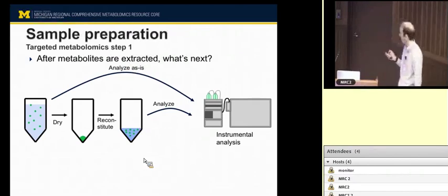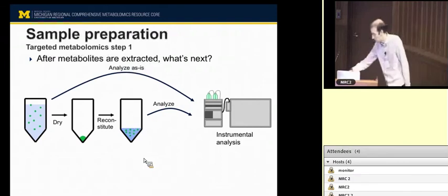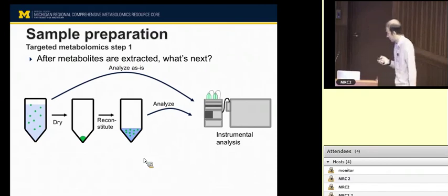And then it's data analysis. And so this is where it should be more familiar in targeted metabolomics. You may be able to interpret a change in metabolite concentration without any further ado. That may be enough. You can do basic statistics, a t-test or an ANOVA, perhaps some multi-comparison correction, and it's as easy as that. A lot of the times it's more complicated.